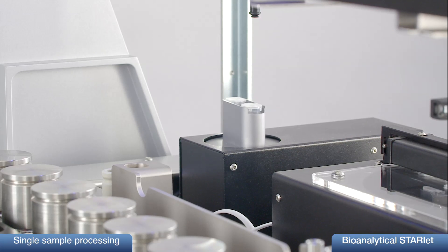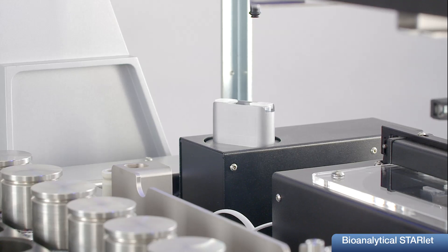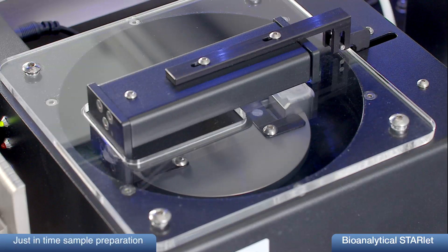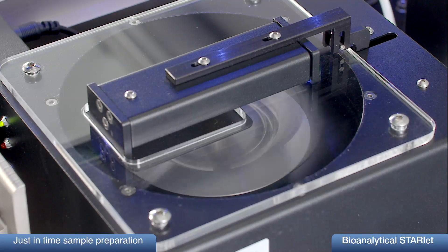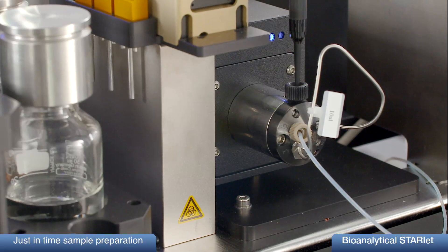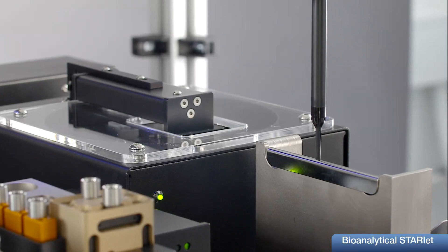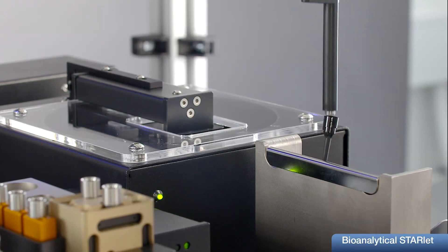Proper mixing of sample and precipitation reagent is secured during mixing with a variant in amplitude and frequency. The entire sample preparation is done during the HPLC runtime — it is a just-in-time preparation. All samples are treated equally in terms of timing, avoiding further degradation, which increases the reproducibility of the results.